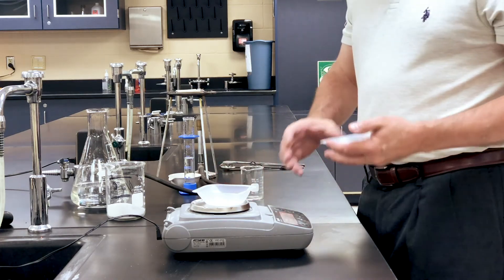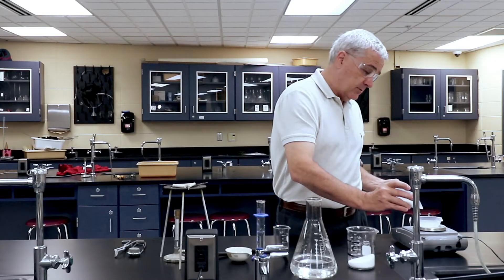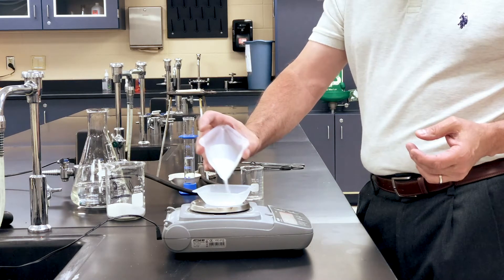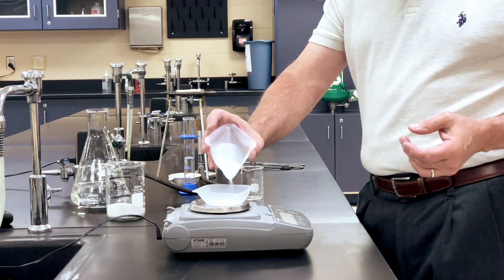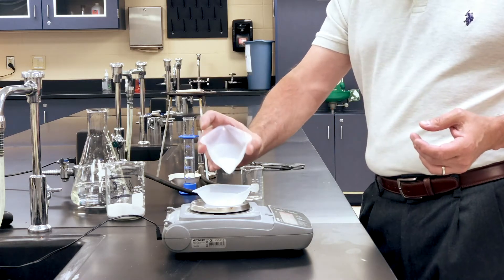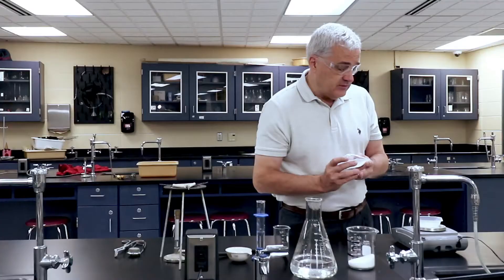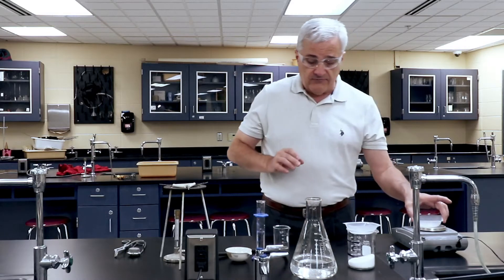I'm going to spill the salt on the table. This is why I wear goggles — if this weren't salt, that could have been a bad thing. I'm going to add sodium chloride to the weigh dish. There's 4.73 grams. And why five? Because five is a nice round number. That's 5.02. And now I have 5.2.